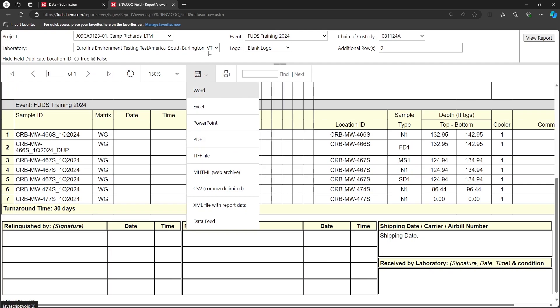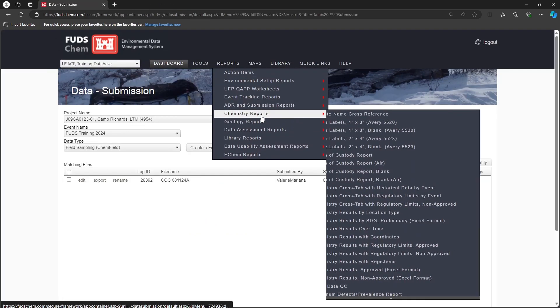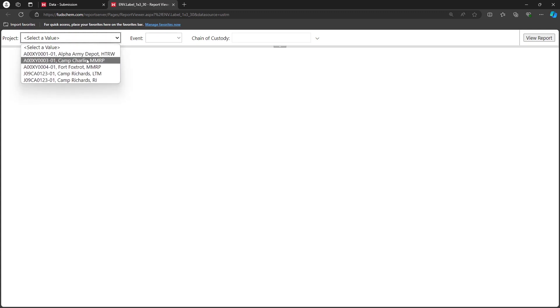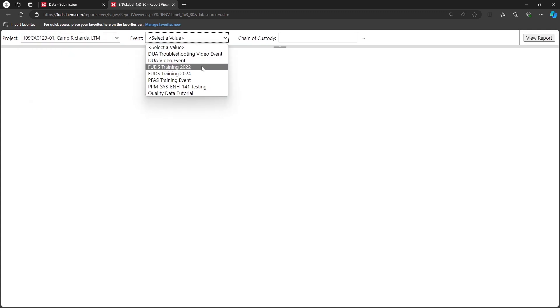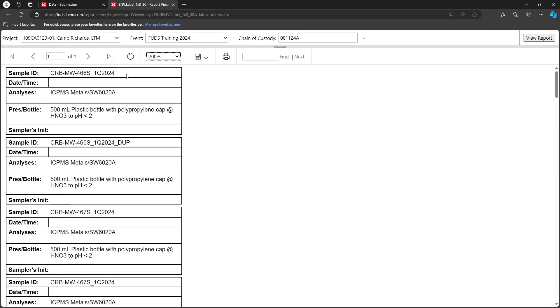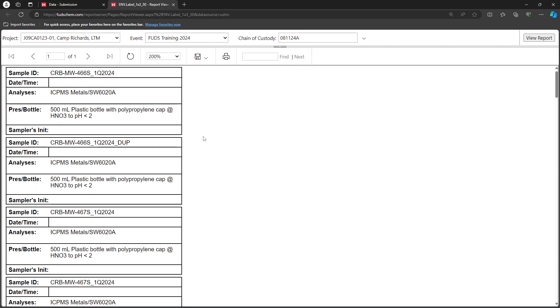Let's return to our main window. Back under Reports, Chemistry Reports, there are also several bottle label options available. The Avery number refers to the size of sticker label to use for printing. We'll select the 1 by 3 inch option. We'll choose our project, event, and the CoC whose labels we want to print. Then click View Report. The labels include the sample names and analysis methods from our chem field file, and the preservation and container information from our eQUAP. We could save this as a PDF and send it to our field team to print onto sticker labels. The blank versions of these reports include the bold labels on the left, but are blank for the sample ID, analyses, and preservation bottle fields.